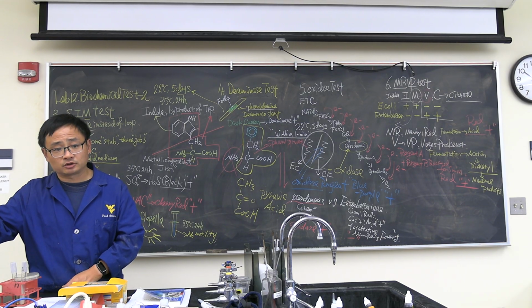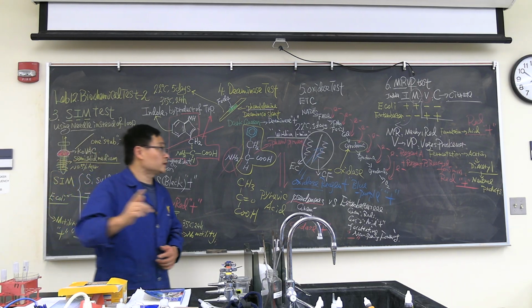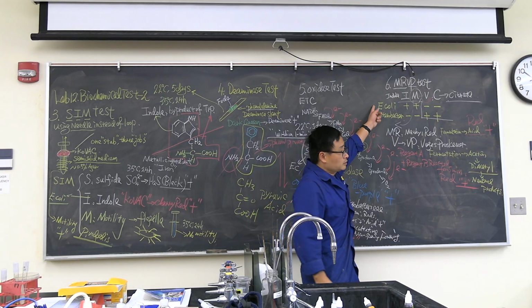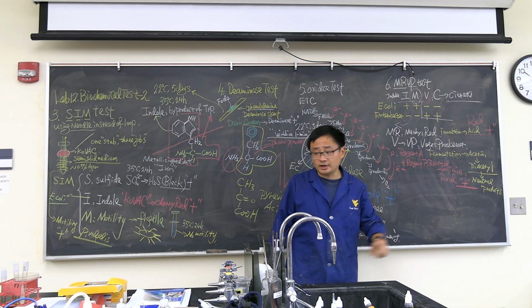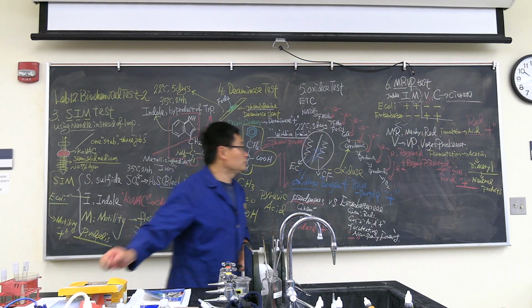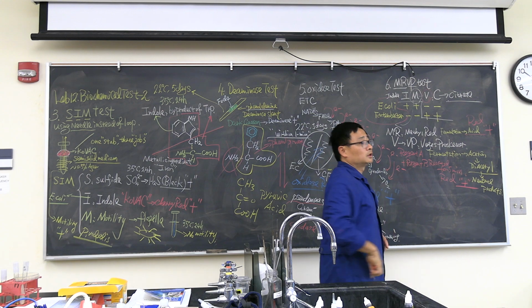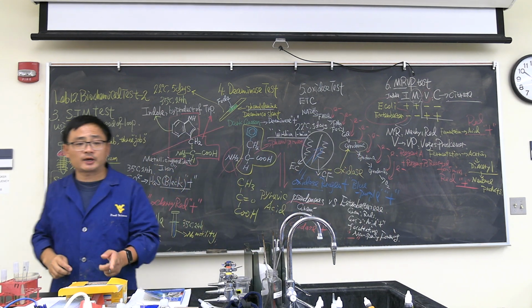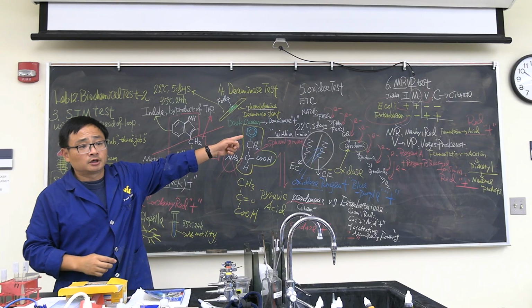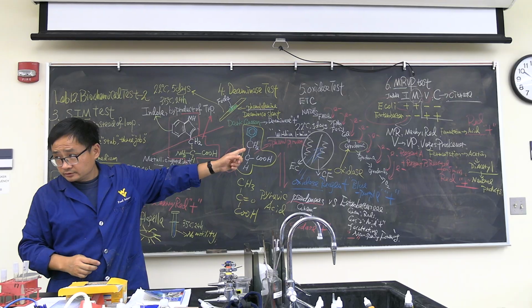This one is special because MRVP is specifically for E. coli and Enterobacter. So the last test, you're going to have to use these two, which means you do E. coli, your bench partner does Enterobacter. Here it is not Citrobacter. Okay?